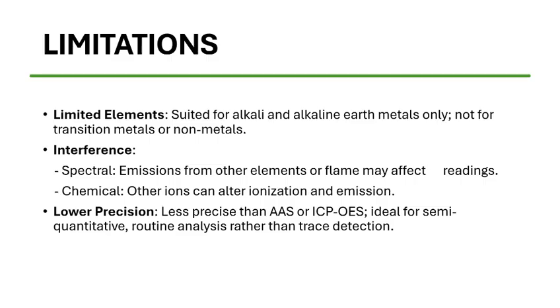However, it does have some limitations. It's limited to alkali and alkaline earth metals, excluding transition metals. It is susceptible to interference from other elements or ions. It is less precise compared to advanced techniques like AAS or ICP-OES, making it more suitable for semi-quantitative analysis.